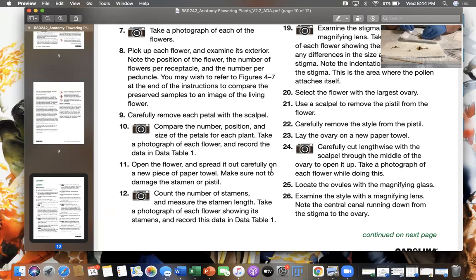If you're struggling like I am, you can use your dissection pins, which I'm actually going to do. Put it right through the peduncle. That way it stops squirming all around. Okay. So now I've got to tease off these inner flowers.